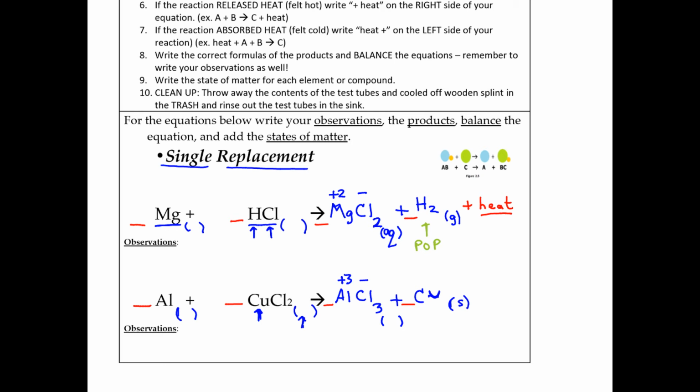And you should have also felt a little bit of heat given off in this reaction. It was not as obvious probably as the one before it, but it was definitely slightly exothermic, so you should have heat written there. And of course, don't forget to write down your observations.